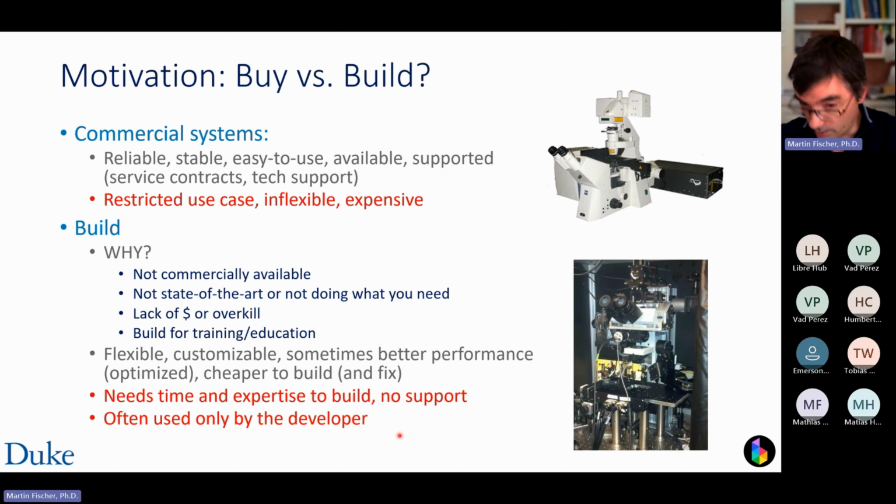Obviously, building one is going to take a lot of time and expertise, not just to build it, but also to operate it and then to fix and maintain it. And what's just as bad is if you go through the pain of building one, most often the group that builds it, the PI or the PI's group, they use it, they move on, and this design that might be applicable to lots of other groups just sits there and gathers dust, or does not get disseminated.